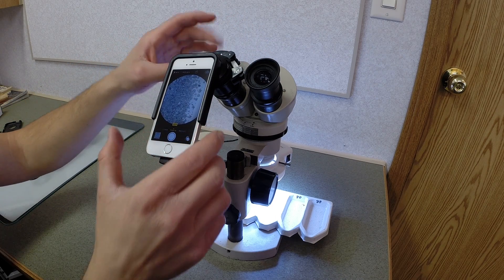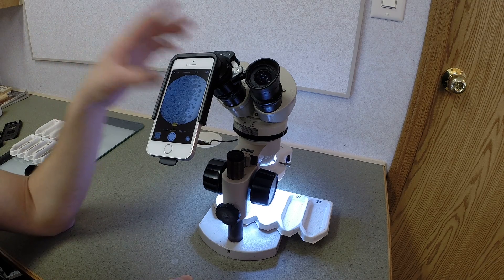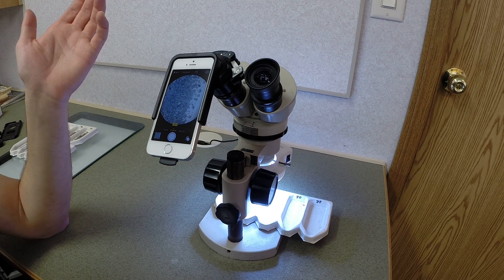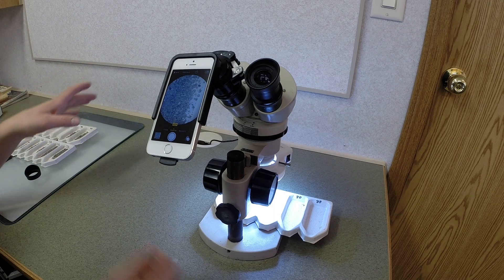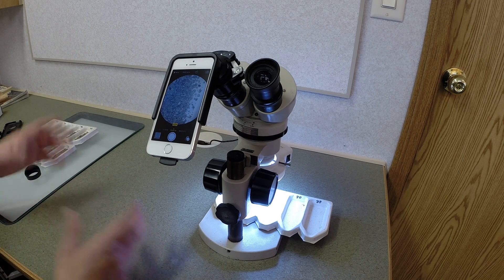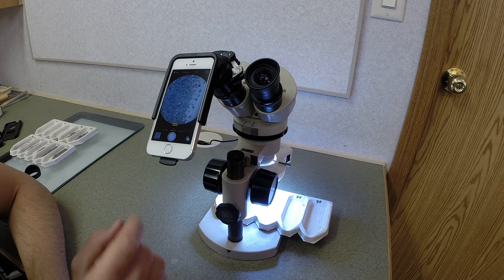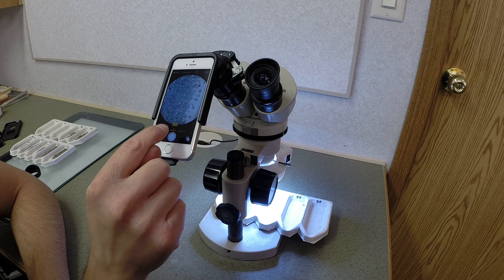You just slide the adapter onto the microscope, onto the eyepiece itself. And that's how quick it was — it's super easy to use. I like it because normally I use a USB extension to a laptop and it's super laggy, takes a long time to set up, you have your laptop there. This is nice, easy, compact, small and quick. And there you go — you can just take some snapshots of it.